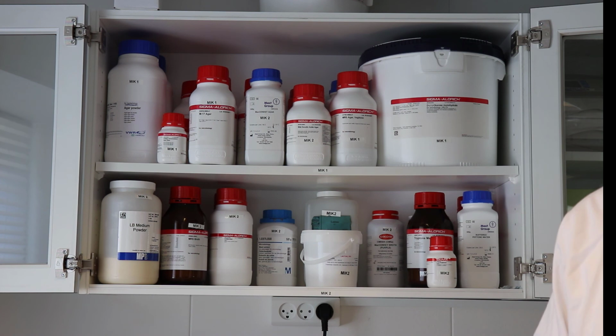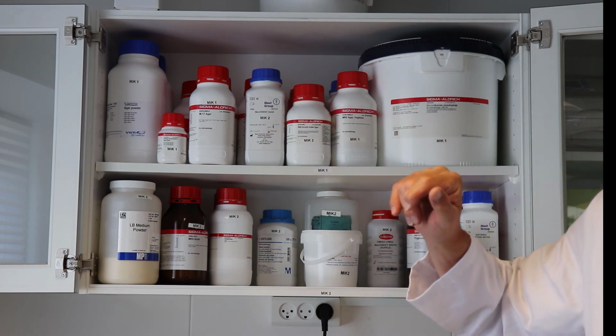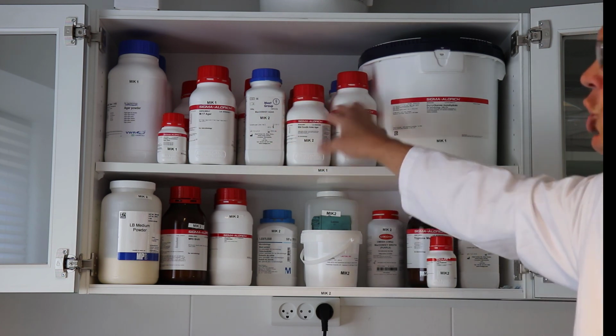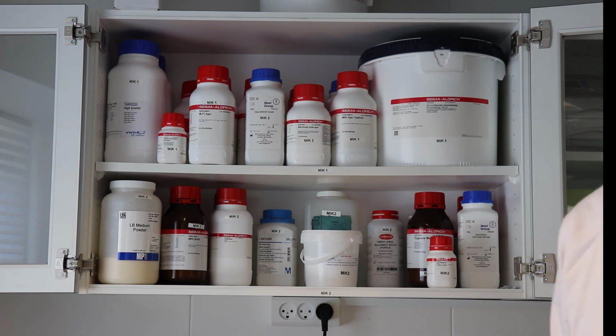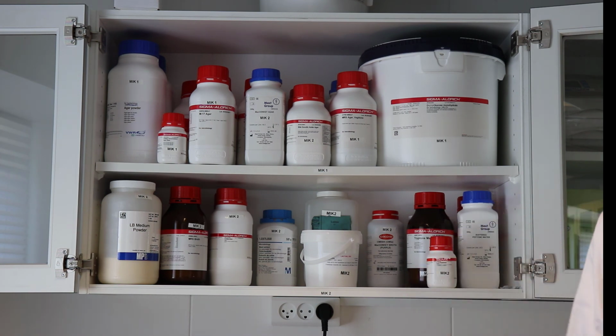Then you will turn to some of these, make some plates, plate out the bacteria you have an idea what it is, and see if you have growth or not growth. Both things will tell you something. A little about the selective media which is present. You can also make your media more selective by adding different types of nutrients like different types of sugar, etc.